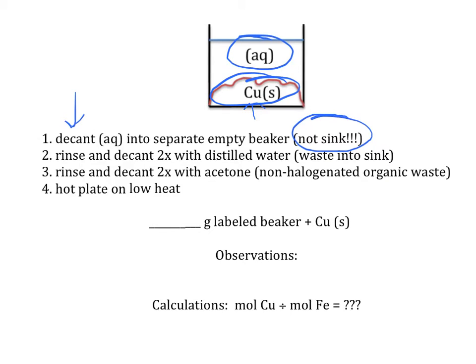So definitely not into the sink. What you want to do is decant into a separate empty beaker, decant off that aqueous solution. That way, if you happen to go too far, you can always just pour it back into the original beaker, and you don't have to start again. So you decant off the aqueous solution, but still got a couple of issues.